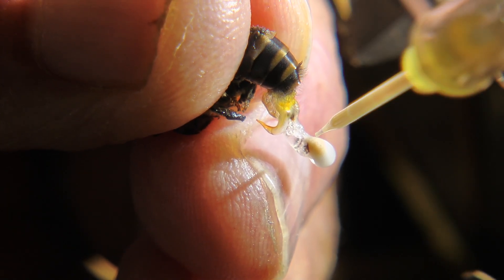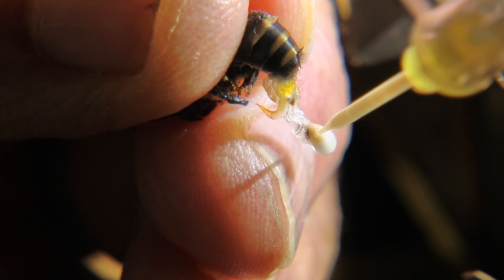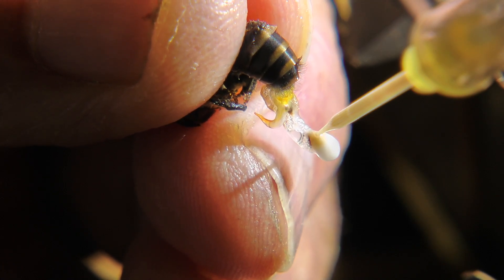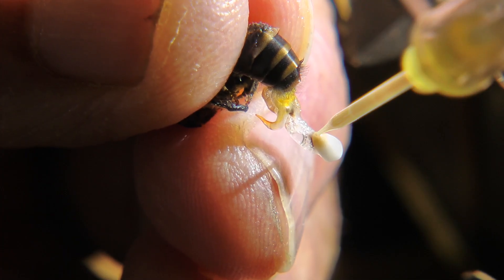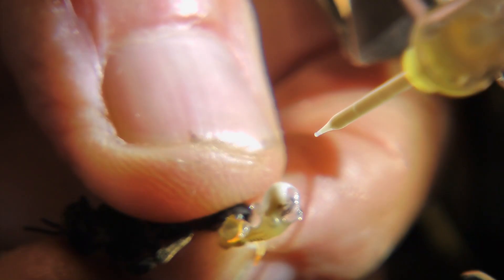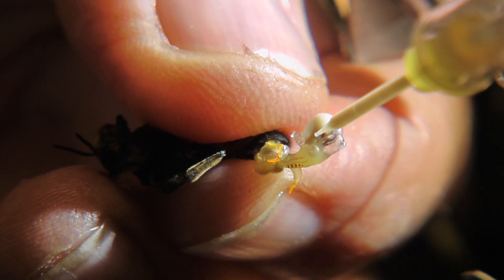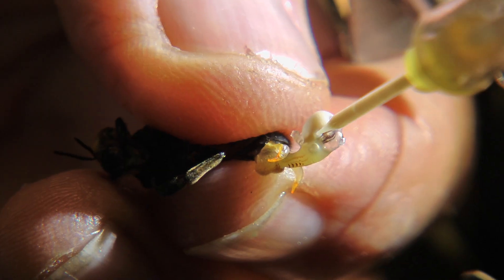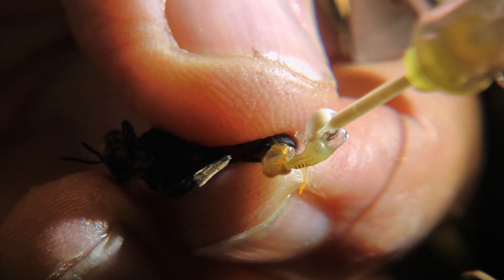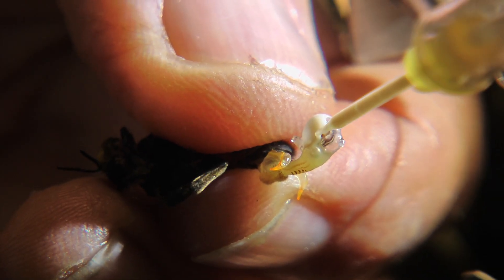The two horn-like appendages are the cornua. The yellow-orange color shows a mature drone. The drone uses these to hold onto the queen during mating. These drones have been selected to be free of aggressive Africanized traits.